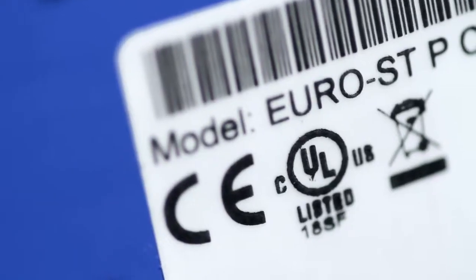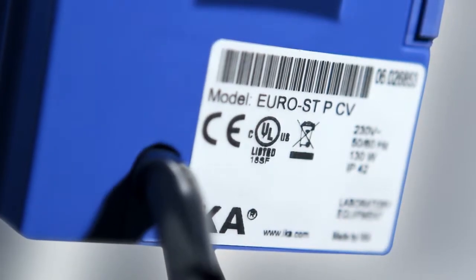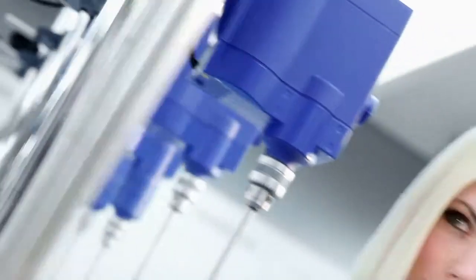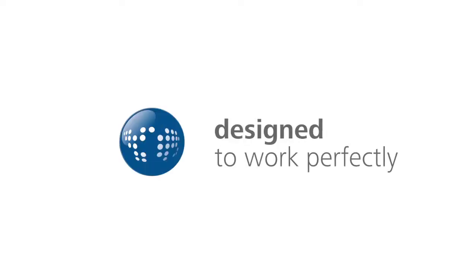Proven brand technology. Certified according to CULUS, CE and IEC. IKA. Designed to work perfectly.